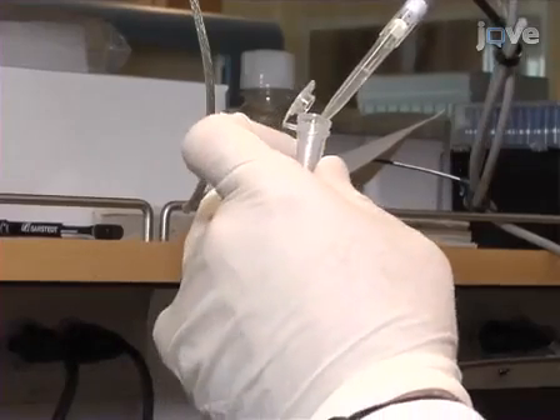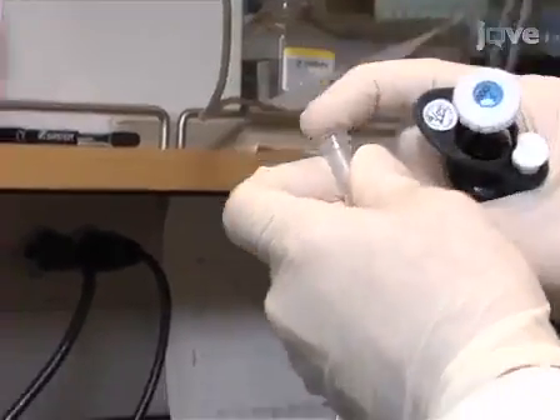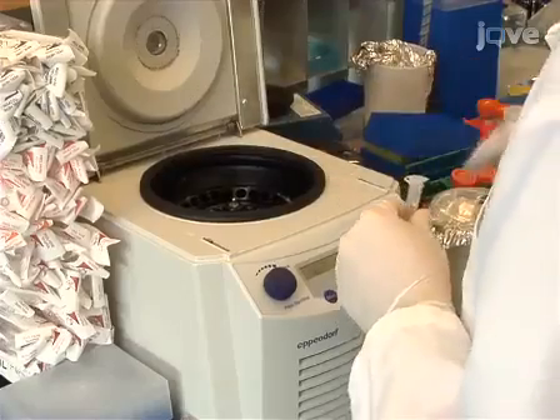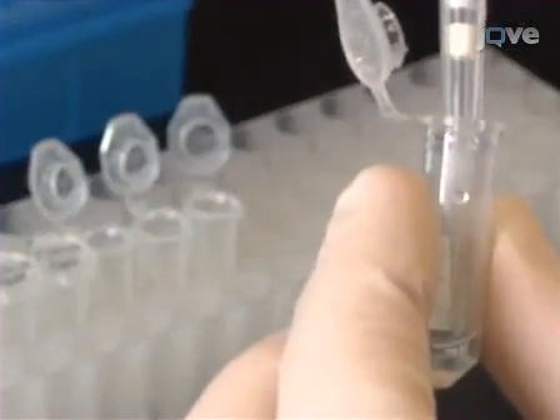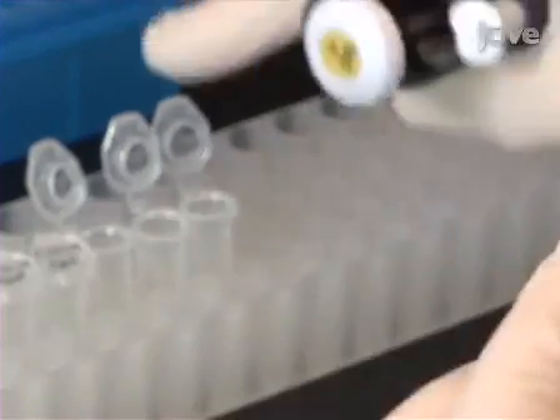The gel matrix is then filtered by pipetting 550 microlitres into a spin filter provided with the RNA 6000 nanokit. Centrifuge the filter at 1500 RCF for 10 minutes at room temperature. Then aliquot the filtered gel into 65 microlitre aliquots, which can be stored at 4 degrees Celsius for up to 1 month.